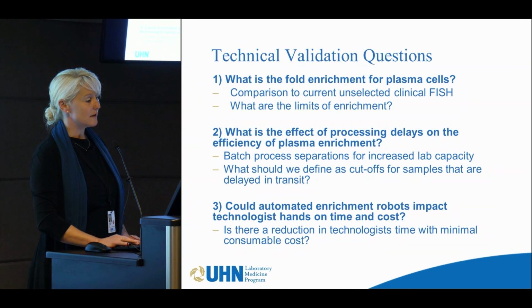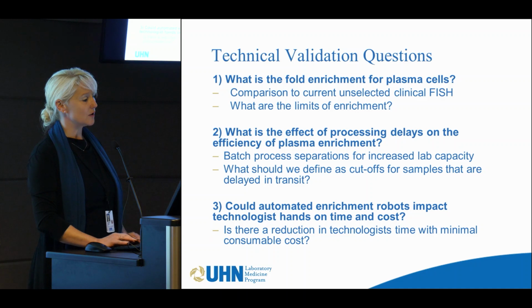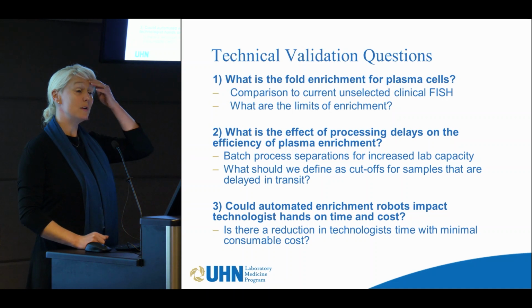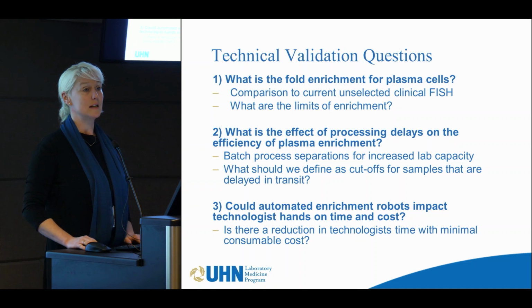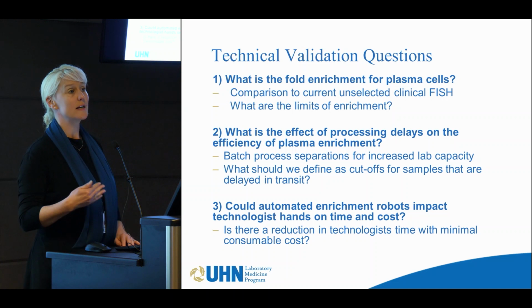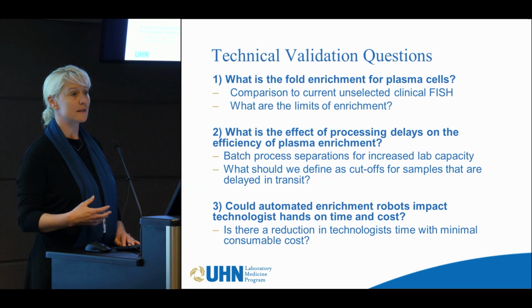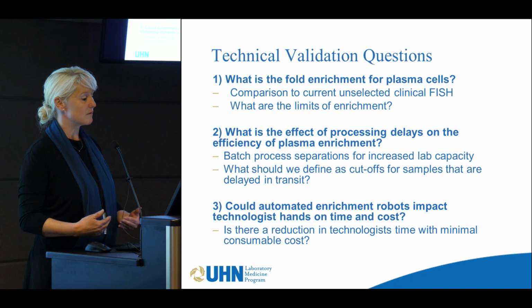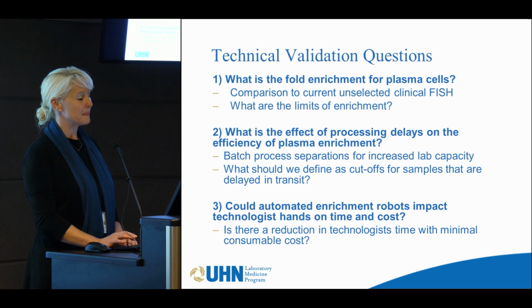So in our study, we wanted to simply determine what the fold enrichment was. What is the effect of delays in processing? As we all appreciate, we don't necessarily receive our samples the same day, and we know that the CD138 can start shedding off the cells within 4 to 6 hours. So it's very important that we track that information, so if we don't get good results, we can follow up. And also, if we could use robotics.